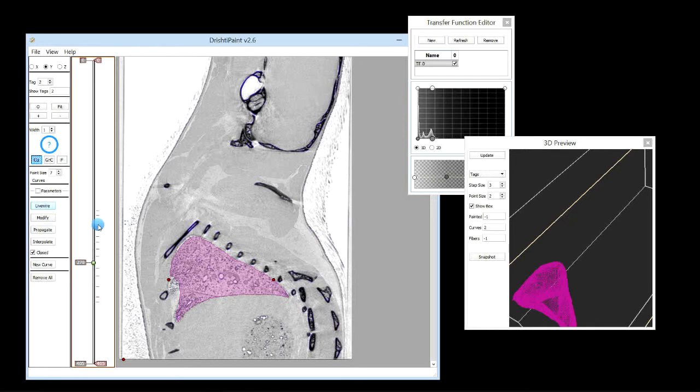Between each of the neighboring curves that we had plotted, the interpolated curves formed a batch, so in this case there would be 11 batches of interpolated curves.